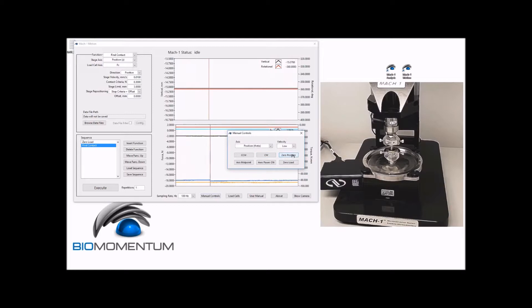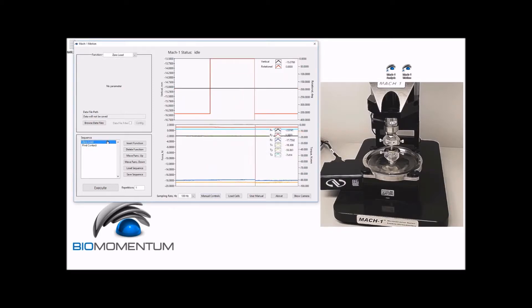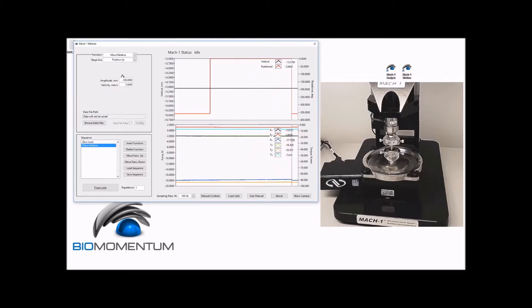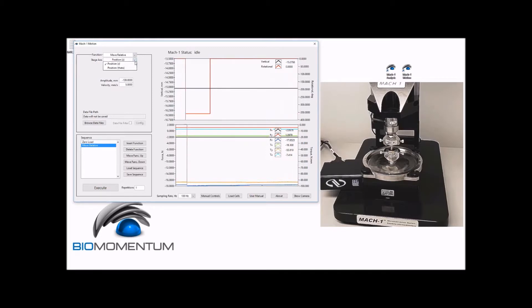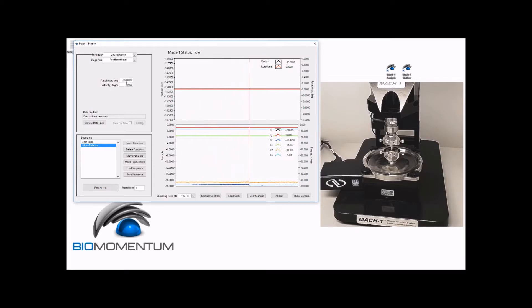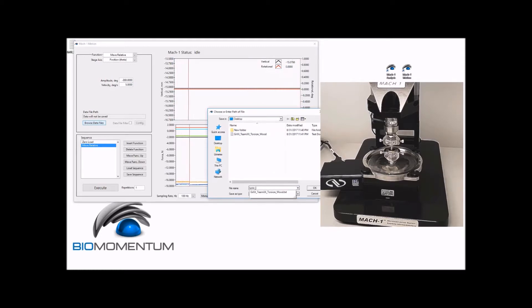Then manually set the position theta to zero. And now proceed with the following sequence to perform the torsion test: zero load followed by a move relative function with the position theta as a stage axis, an amplitude of minus 360 degrees, and a velocity of five degrees per second.